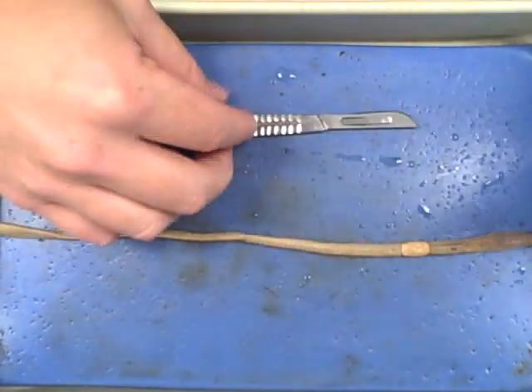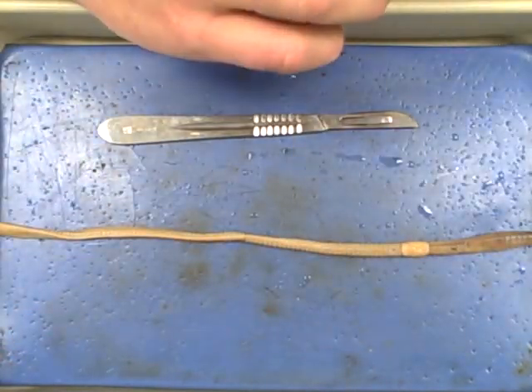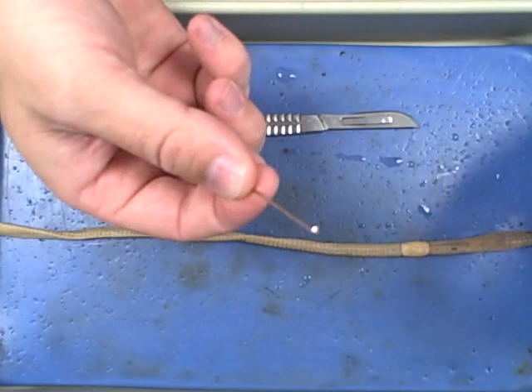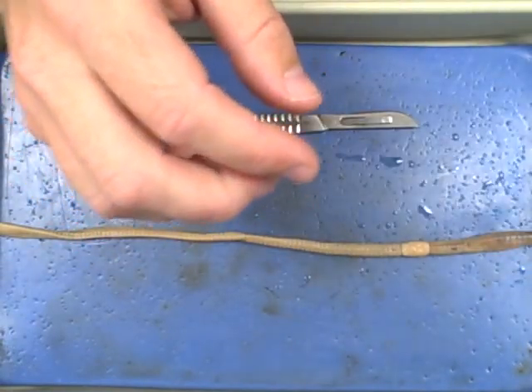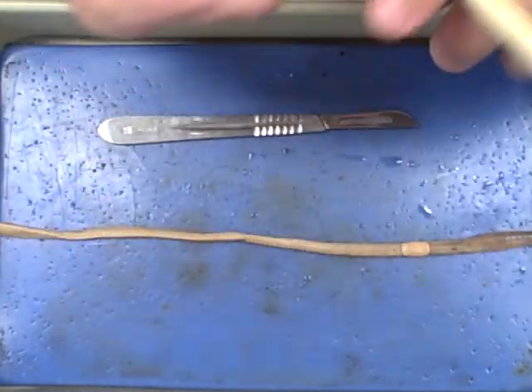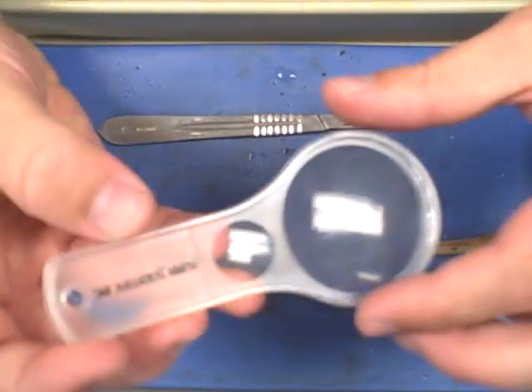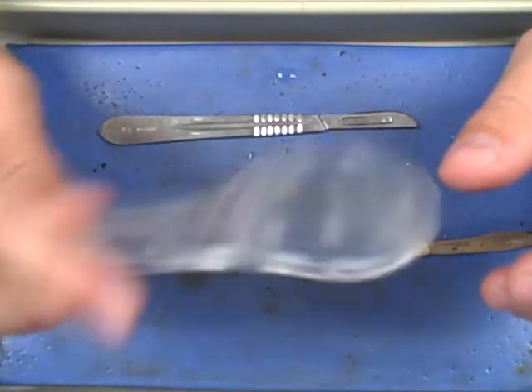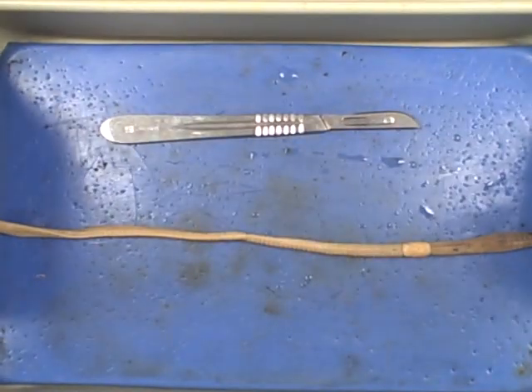You may also require scissors, some dissecting pins — plenty of these — a dissecting probe, and you'll also be given a dissection hand microscope. Now we're all ready and set to go.